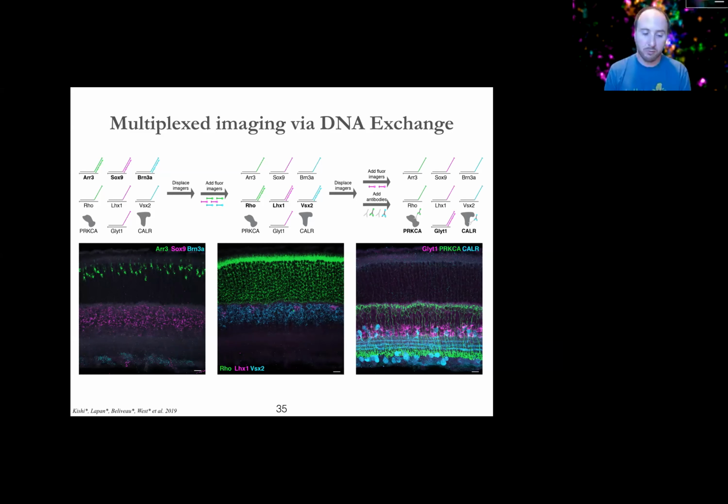So for any of these sequential imaging techniques that rely on readouts that vary by round, you hybridize to target 1, then you somehow remove that signal, and then the next round you hybridize to target 2, and so on and so on. The rate limiting step is always going to be association of a new label with the target that's docked in situ. That's because collision frequency is really what's bounding the ability of these things to hybridize, and the concentration of what's associated either on the RNAs or on pieces of chromosomal DNA you're trying to target in situ is extremely low.